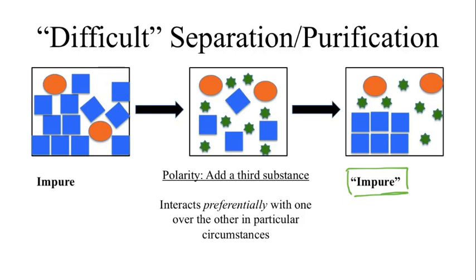Okay, what can we do in these stages to control that dissolving process? Okay, well, remember our very first attempt at trying to separate these things was to heat them up. As we heated them up, we break down those intermolecular forces holding those individual molecules attached to each other. Okay, so what happens if I add heat and add solvent?